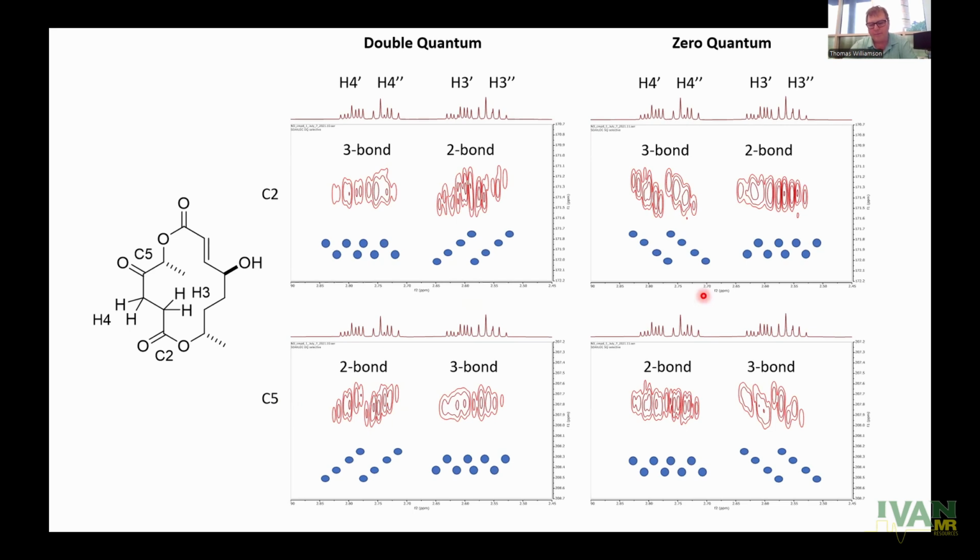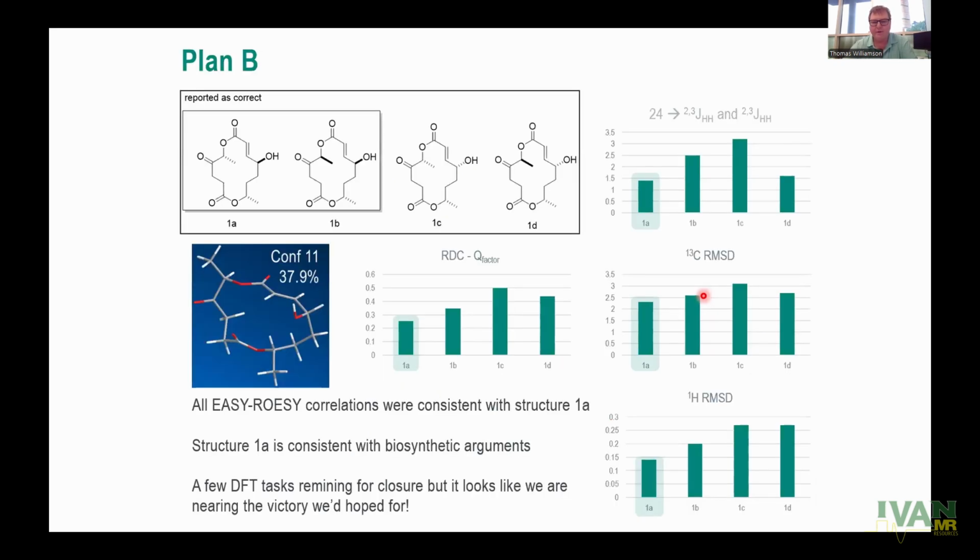Then it doesn't really work very well. Supposedly we could determine it through looking at the line width and all that, but it's pretty ambiguous when you get to that stage. So it still left a lot to be desired, but in our case, it actually worked and allowed us to select the conformers that were relevant to our analysis.